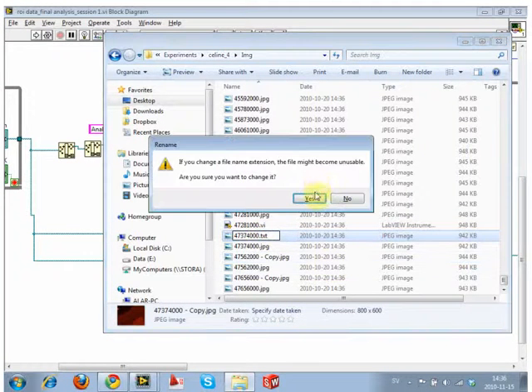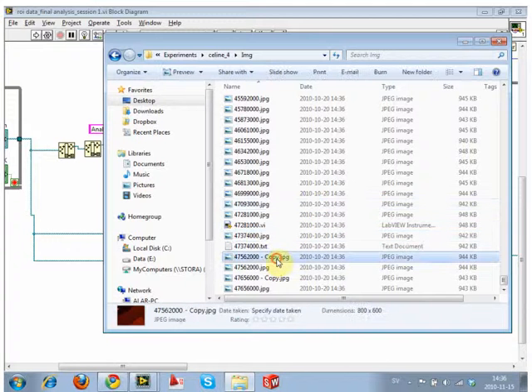You could be a dot .avi, and you can do a dot .lei.